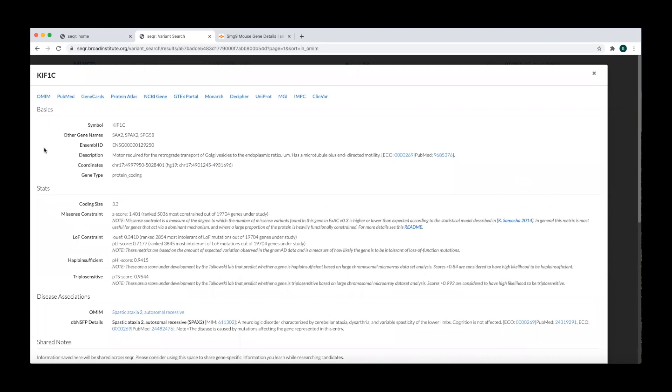On the top of the gene page, various link options are displayed. Hovering over will give you details about each particular option.